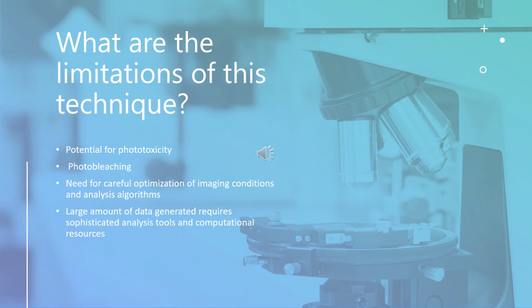Another limitation is the need for careful optimization of imaging conditions and analysis to minimize variability and ensure reproducible results. There is also a large amount of data generated by high-content microscopy, and it requires sophisticated tools and computational resources.